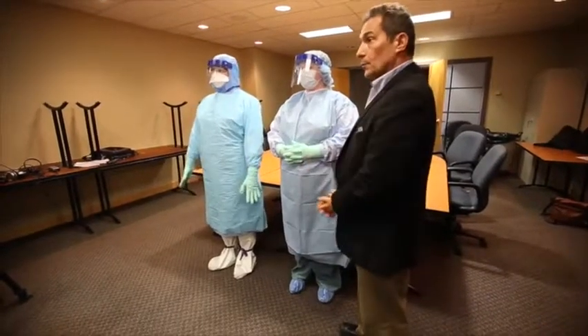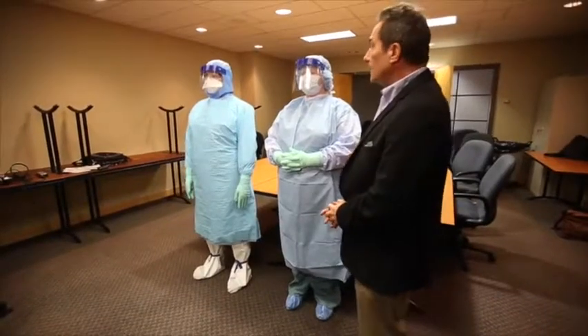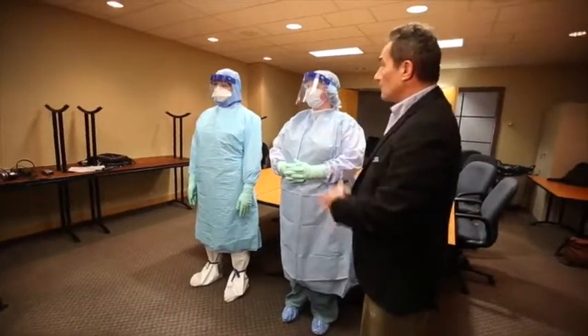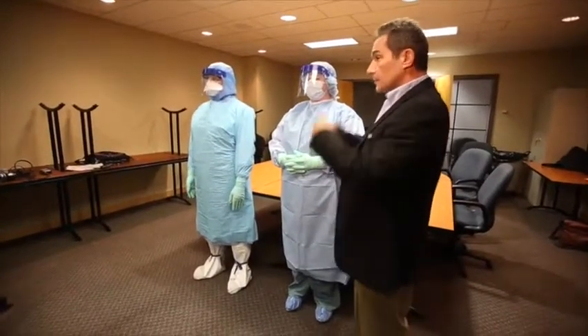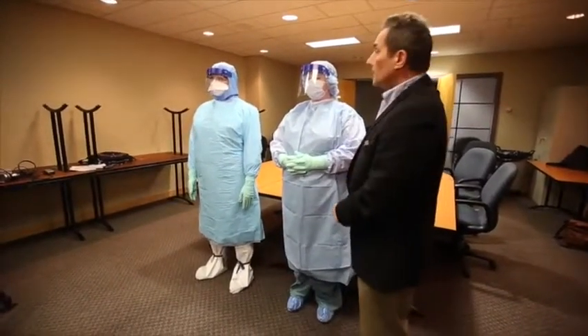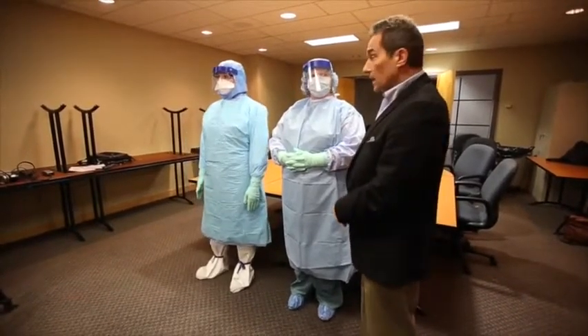To quickly walk you through some of the equipment that we are using and recommending, starting from head to toe: we've got a head cover and a neck cover. You can see that there's protective eyewear, there's a face shield on top, and there is either a surgical mask or in this case a respirator — an N95 respirator.